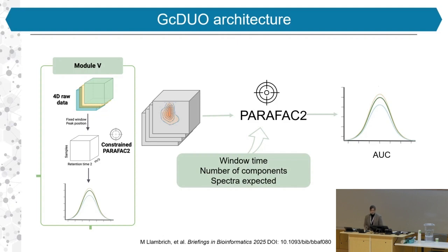As we are now using batch samples, we select PARAFAC2, which is a modification of PARAFAC that accommodates the loss of trilinearity in the data. So we have batch samples, and this is a common thing that happens when we are analyzing in batch mode.